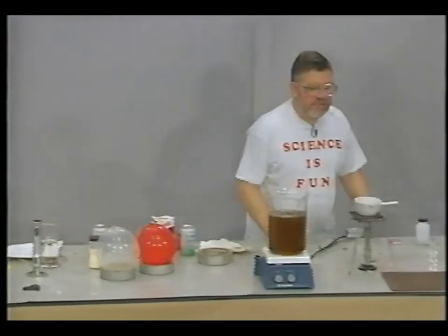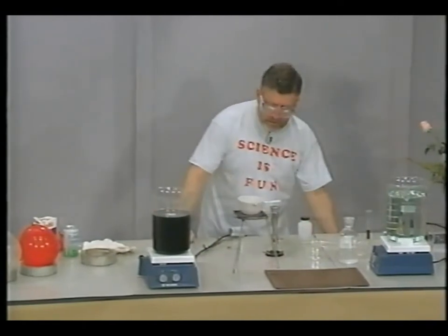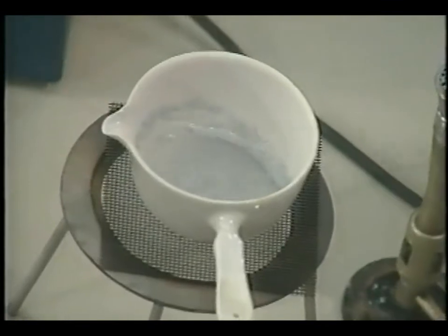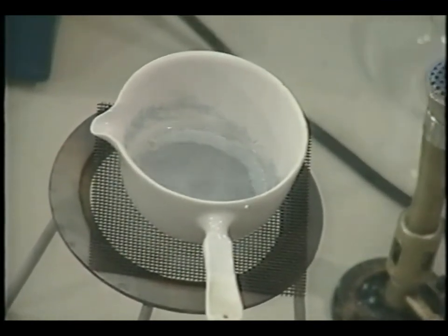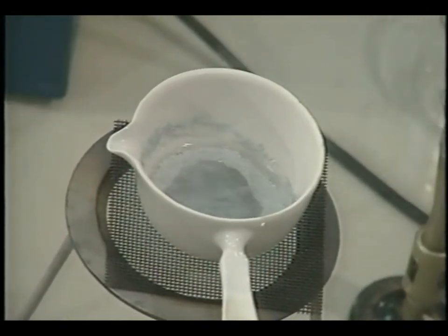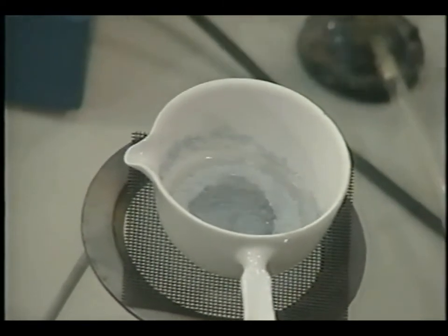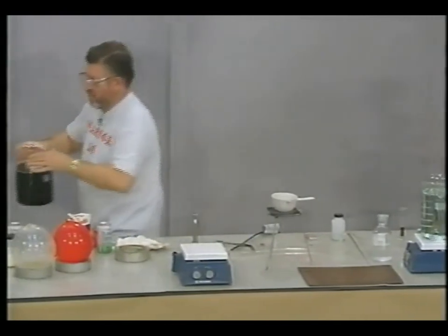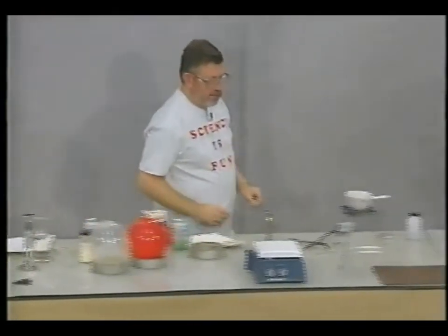Okay, let's take a quick look at these pennies here. We see the liquid is boiling. And so what I will do is I will look for a way to get the liquid out. Before I get the liquid out, I want to get the flame out of the way so I don't burn myself. And I'm going to get the chemical oscillating reaction out of the way too, so that we have plenty of room to see things.